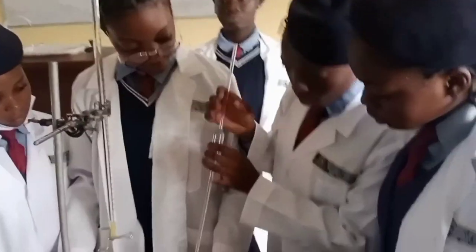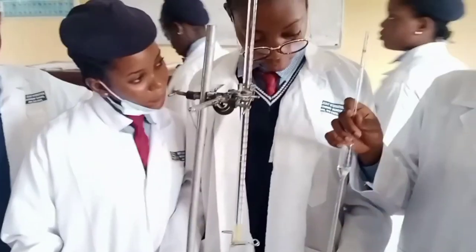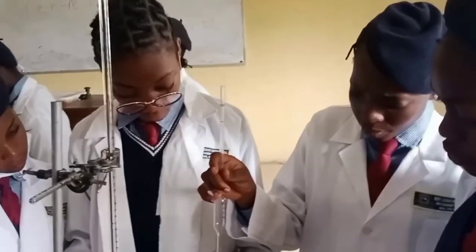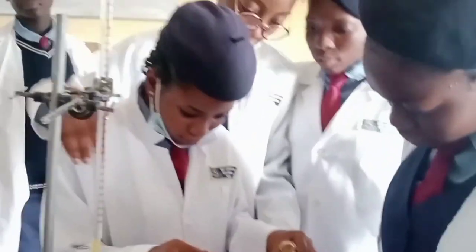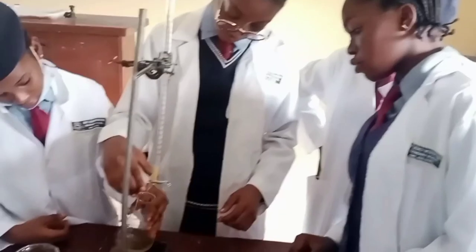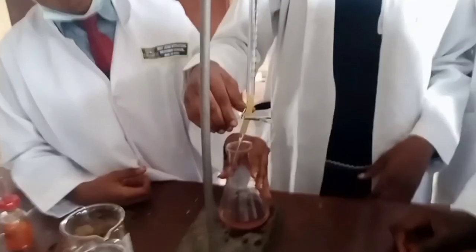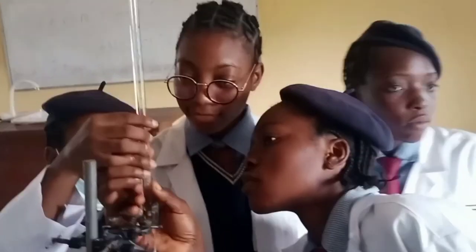And why do we do that? In order to avoid further dilution of the base we are going to measure with the pipette. Then another thing I ensured when I was taking this reading is that I observed the lower meniscus of the pipette. And there's a particular small drop at the tip of the pipette. I ensure that I do not blow it. Those are the precautions I ensured while taking my readings on my pipette.